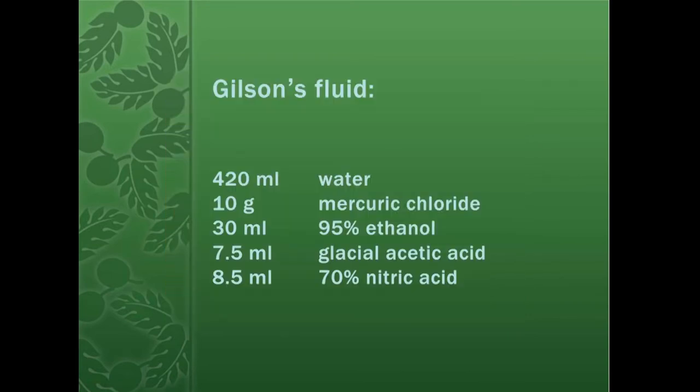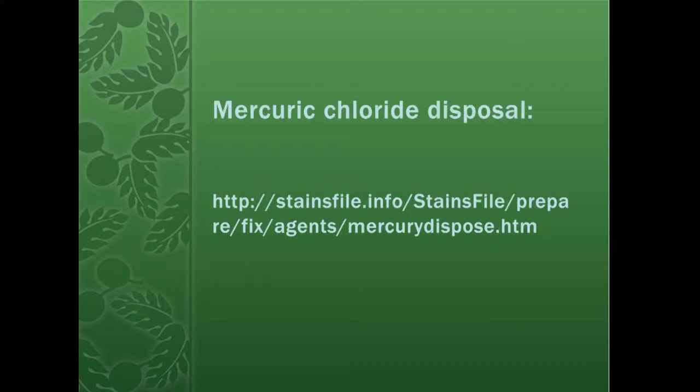And here's the recipe for that Gilson's fluid that I keep mentioning. I want to highlight this one ingredient. Unfortunately, it's classified as a marine pollutant. Of course, we don't want to go around doing rapid reproductive analysis, trying to improve the state of fisheries and then dump a toxin into the marine environment. So we want to be sure that we dispose of this stuff properly. And here's the address of a website that provides two methods of dealing with mercuric chloride.